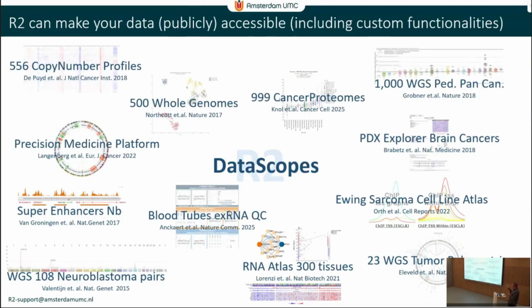I've shown you a number of analyses now, things that you actually do by clicking and then making selections. R2 also has a whole section of something that we call data scopes. And data scopes are essentially landing pages within R2 where we've already preloaded a lot of things. So a lot of settings have been preset, and this allows you to have a quick start. And this has been used already quite a number of times in publications where people present their data in R2 as an interactive platform where you can then play with the data that has been presented in these publications.